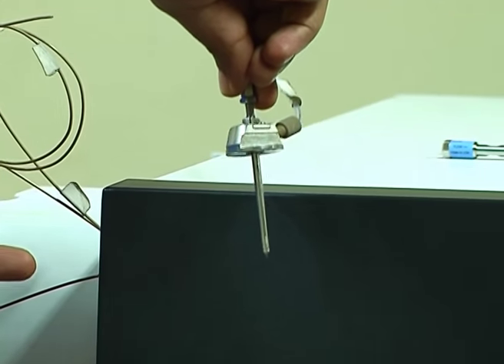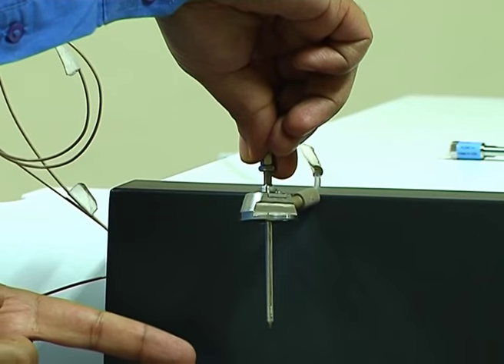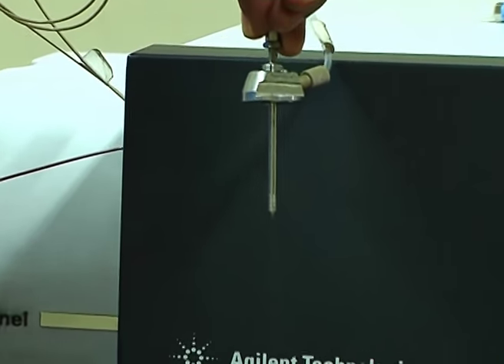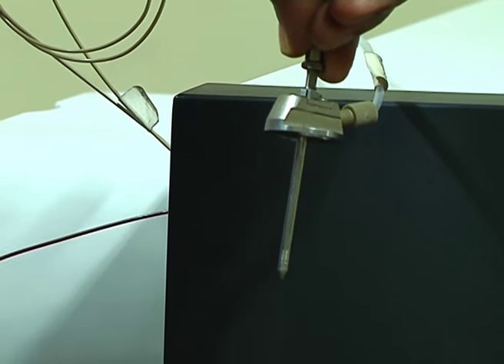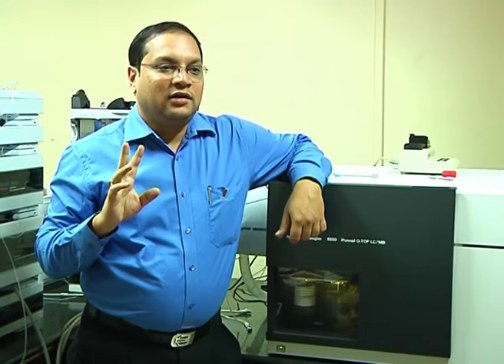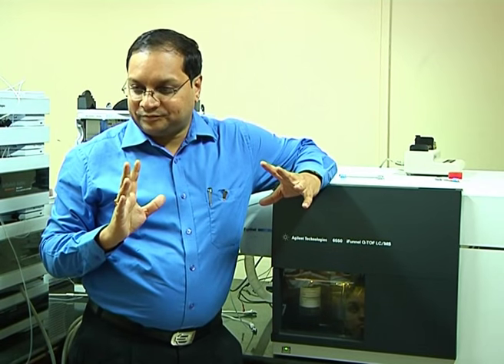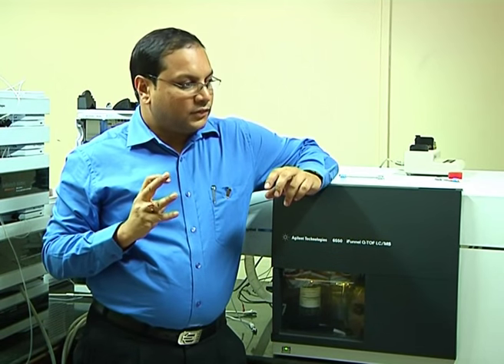You see, this is how it happens. Now one drop has become like this spray, and inside there is high temperature, 300. You can imagine how fast, unimaginable speed it has. So there are different analyzers. Quadrupole is one type of analyzer. Okay. Analyzer of mass. Mass analyzer.